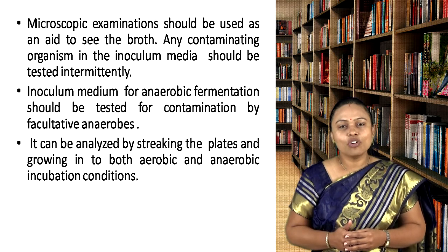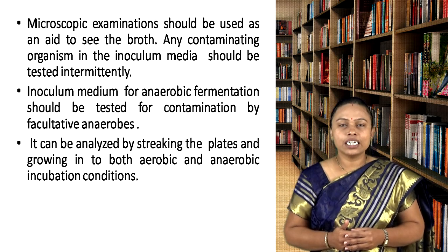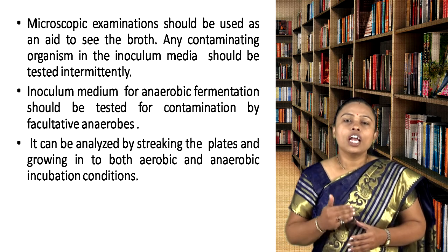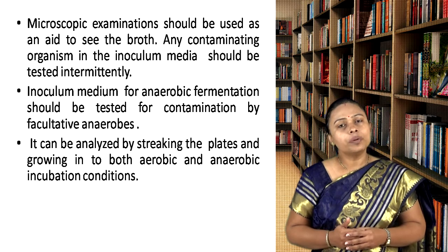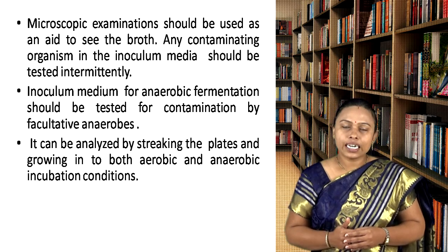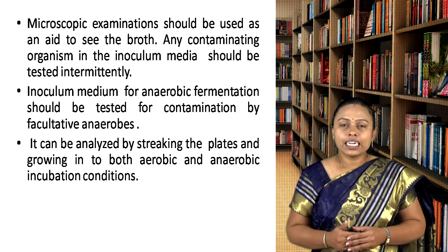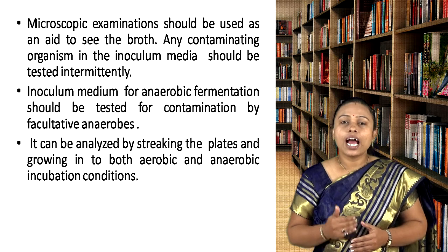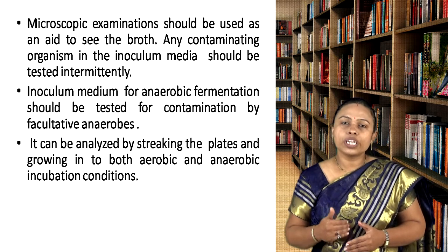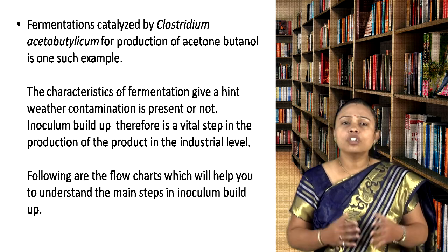Any contaminating organisms in the inoculum media should be tested intermittently. Inoculum medium for anaerobic fermentation should be tested for contamination by facultative anaerobes. It is easy to analyze by streaking the plates and growing them under both aerobic and anaerobic incubation conditions.